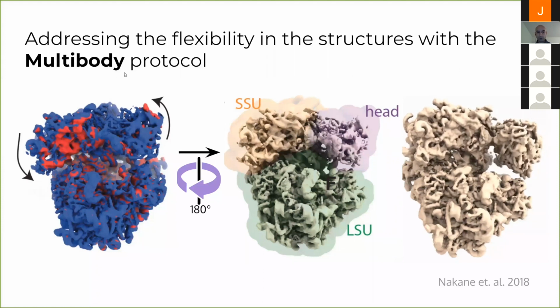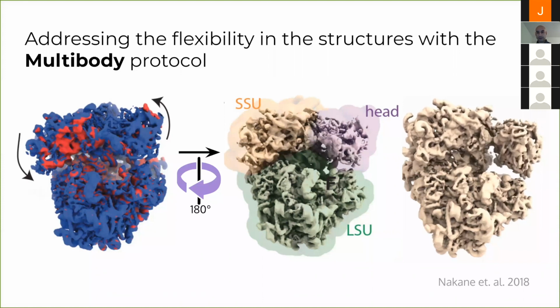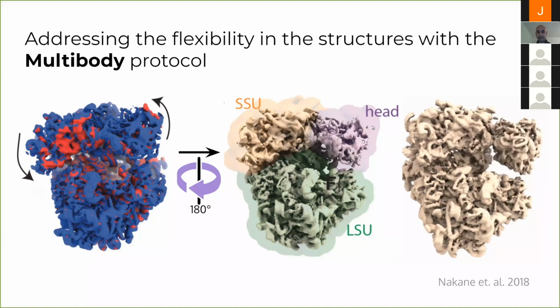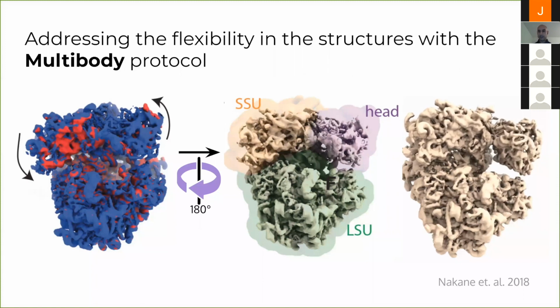Another example would be Multibody, where the flexibility in the model was addressed by allowing the user to input some prior information about which parts of your biomolecule are flexible relative to each other. This protocol then reconstructs those individual parts, pushes the resolution of those individual parts further, and you can also get some statistics about the flexibility in your model.